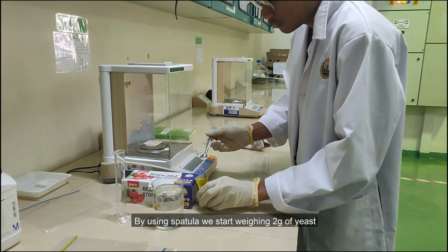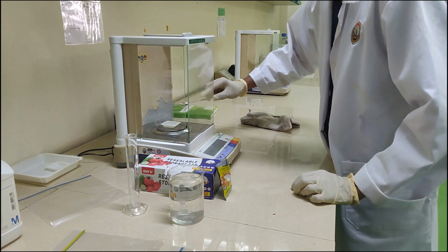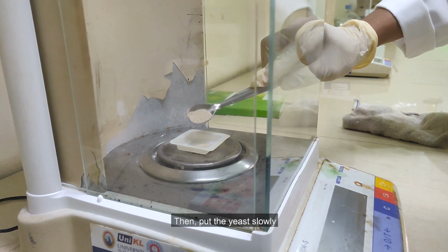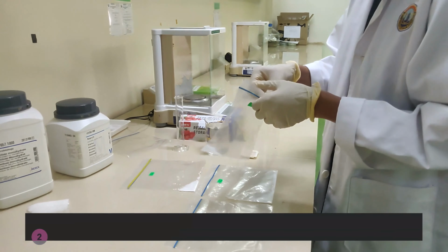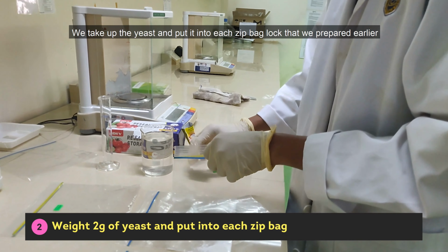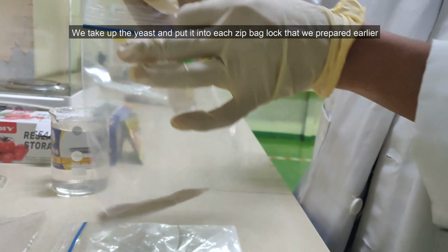By using a spatula, we start weighing 2 grams of yeast. Then, put the yeast slowly. We take up the yeast and put it into each Ziploc bag that we prepared earlier.